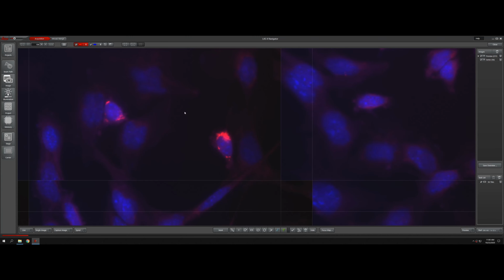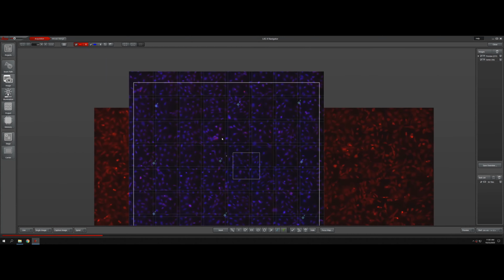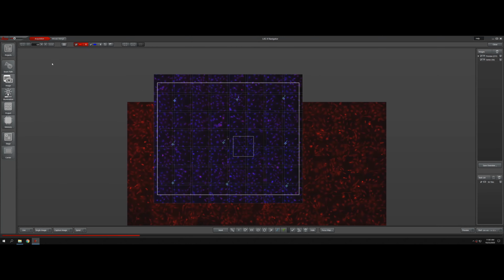So our tiling is done, and if I go to projects, I can see this already merged and saved.